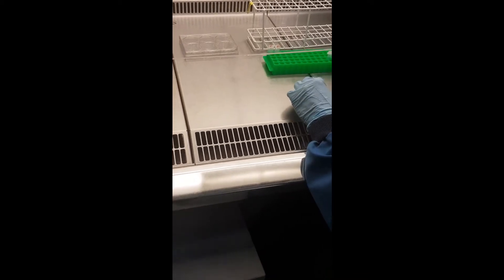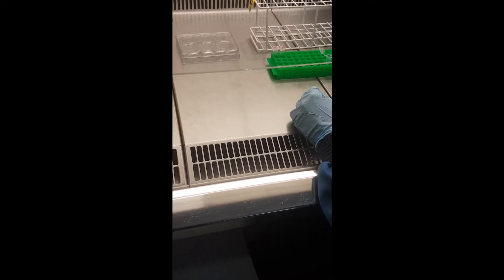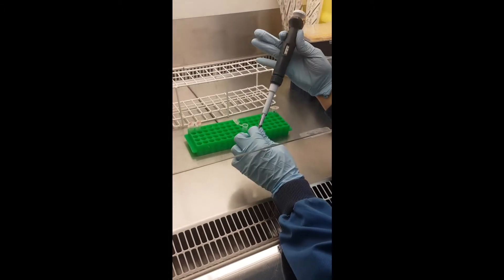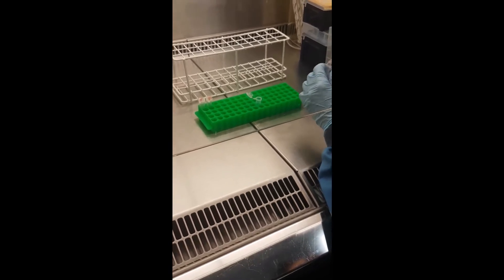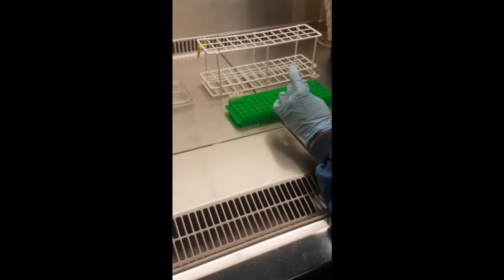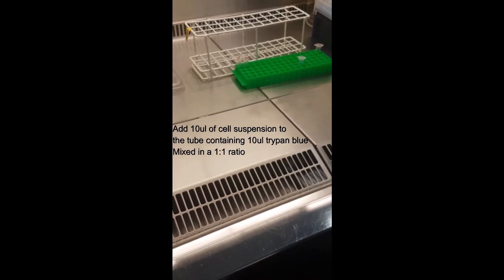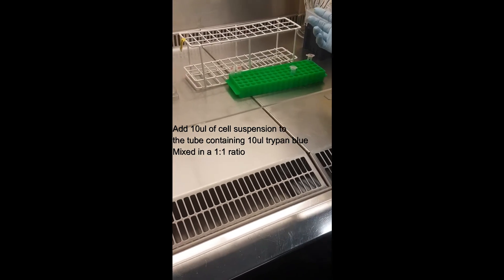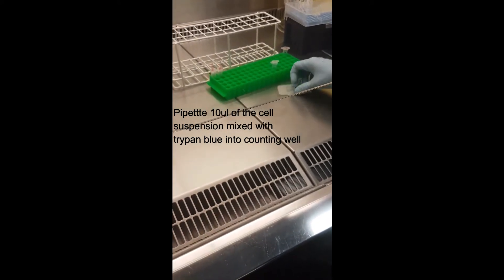For the counting, we have an empty tube and will add 10 µL of trypan blue, which is usually kept inside the hood. After we have the cell suspension ready, we add 10 µL of cell suspension to give a 1:1 mixture of trypan blue and cells. Then 10 µL is taken from the tube into the counting well — you can see the half-moon shaped area where you load the sample.